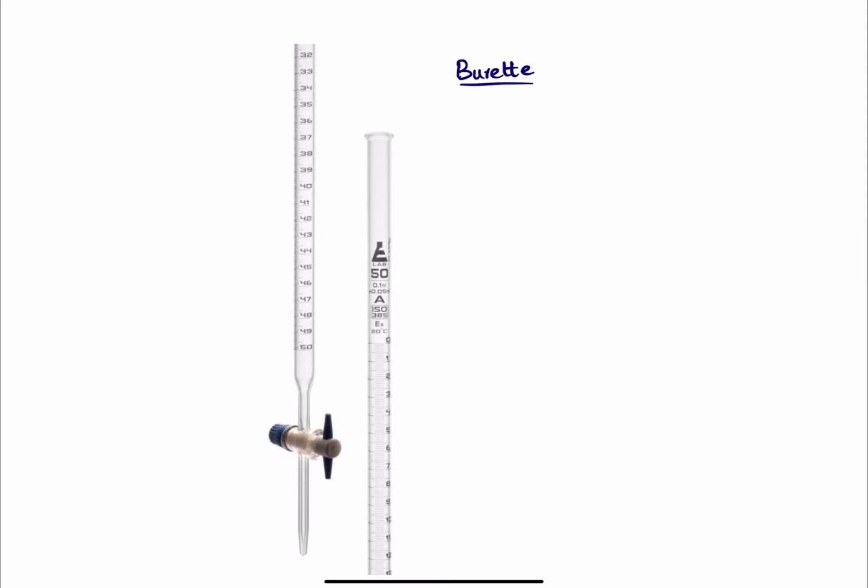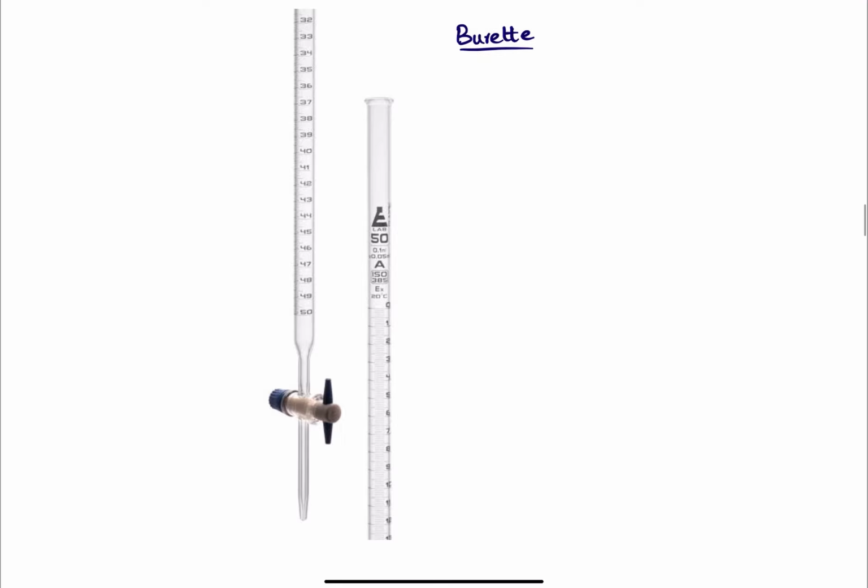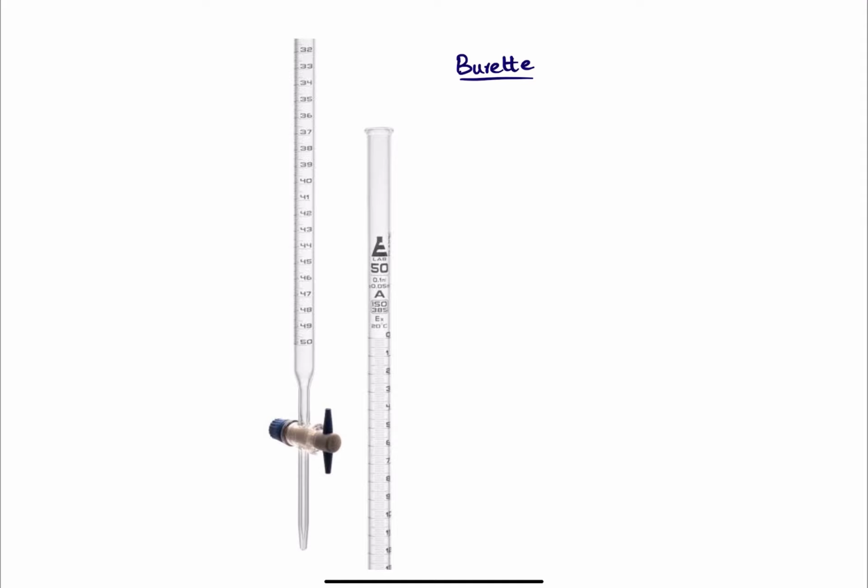apparatus is a burette. And a burette accurately measures the volume, because if you see, this is how a burette looks like. So a burette is accurate to the least volume. The least volume a burette can measure, let's see, is, so you have 0, and this is 0.5, and this is 1. So the least volume a burette can measure is 0.1. You can see over here.